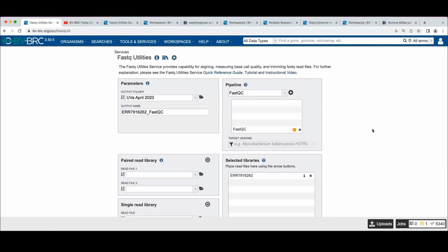Well, while we're here, rather than jumping over and looking at the job, if I decided I didn't want to do that, you can click that off. And I really wanted to trim it. Trimming uses Trim Galore. And one of the things we get asked all the time is, can I set how much to trim off either end? Right now, you can't do that.